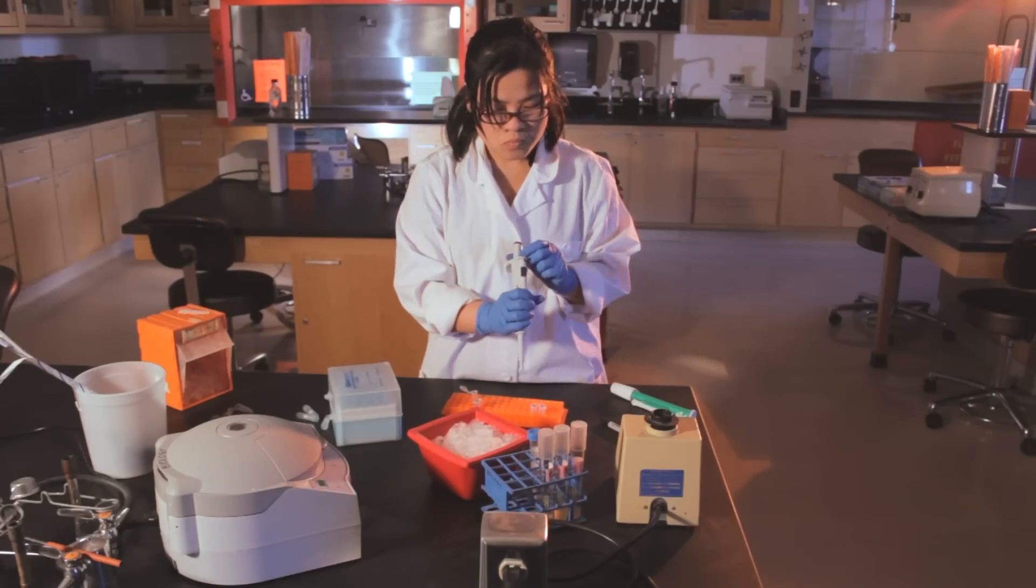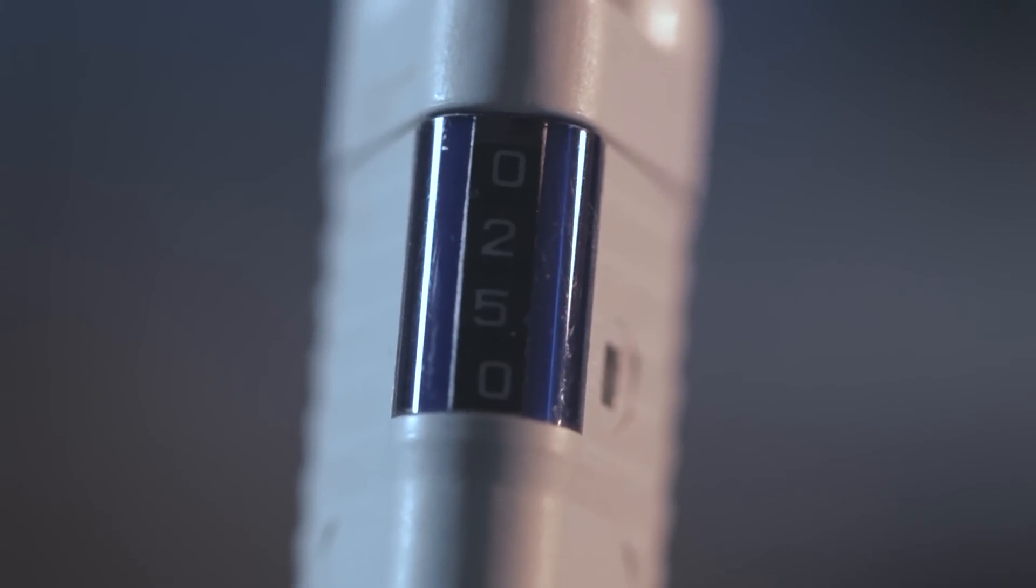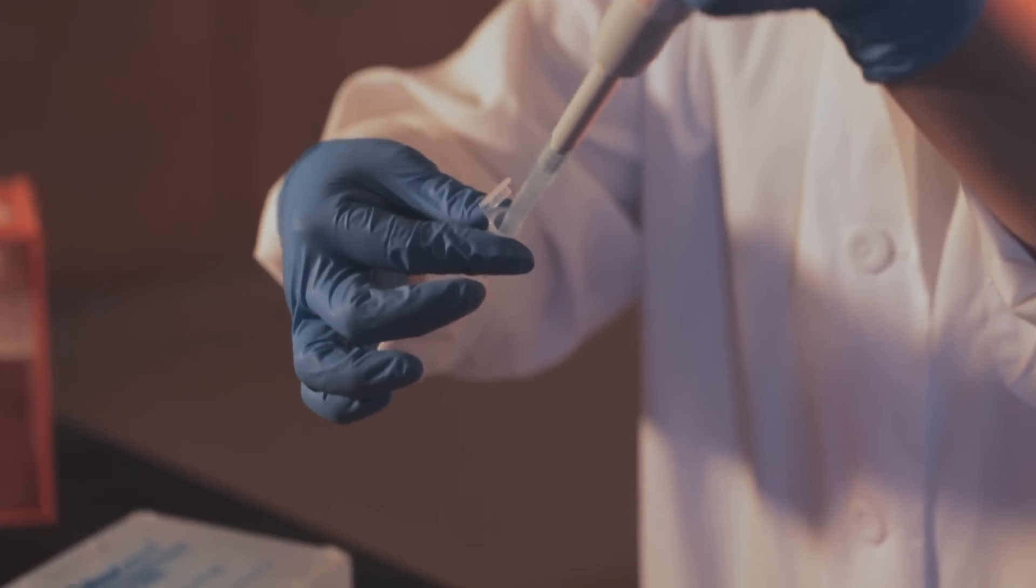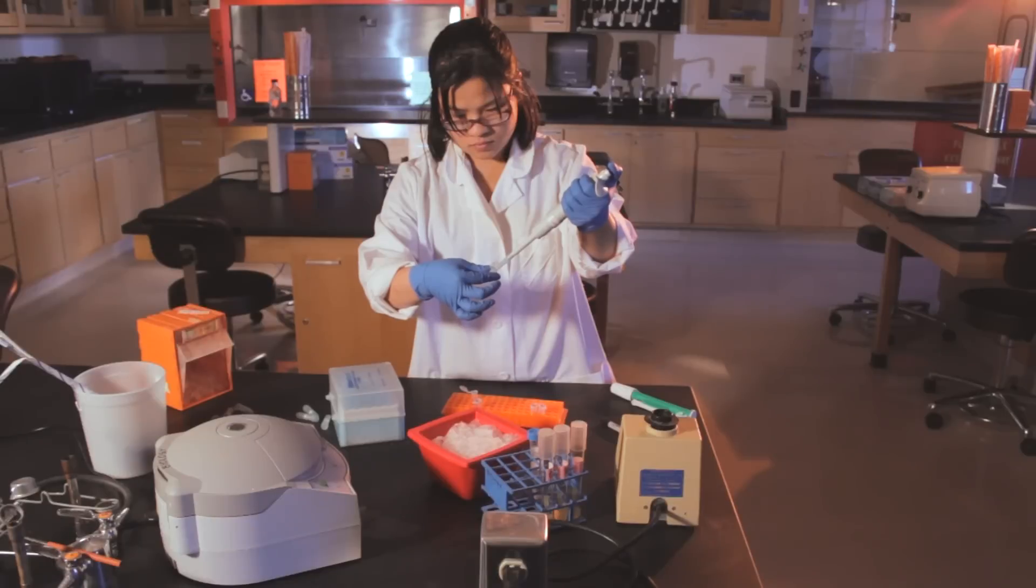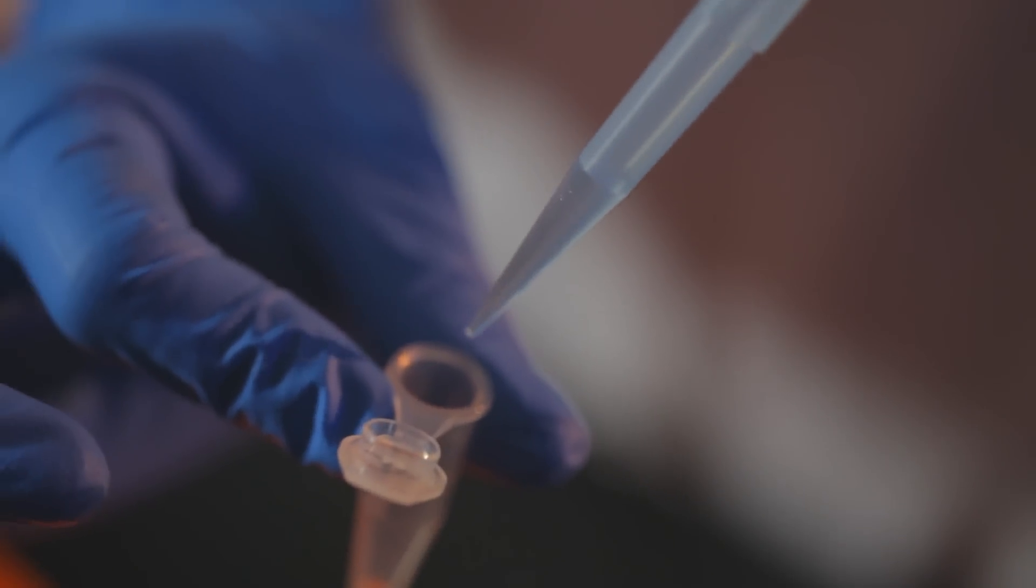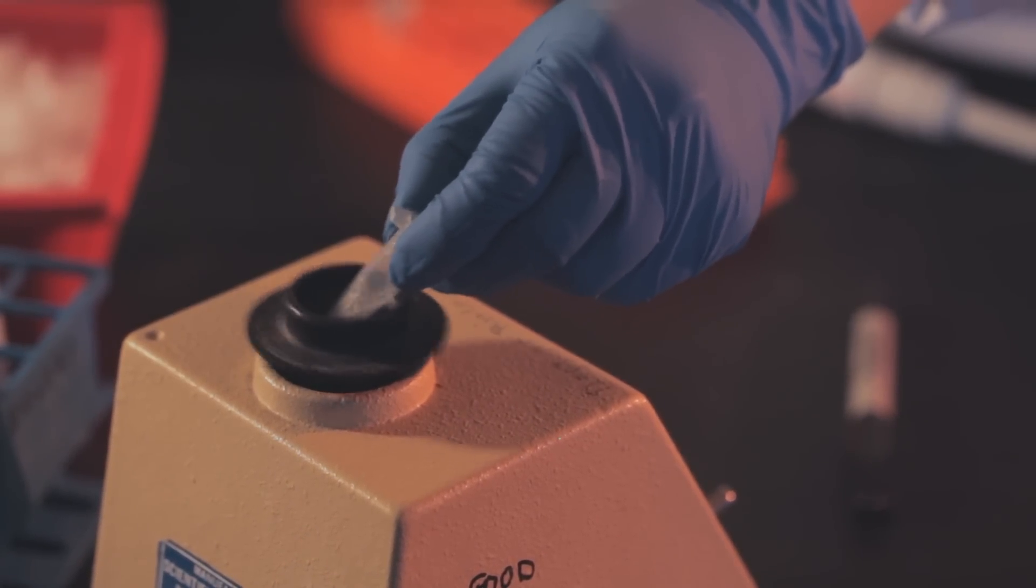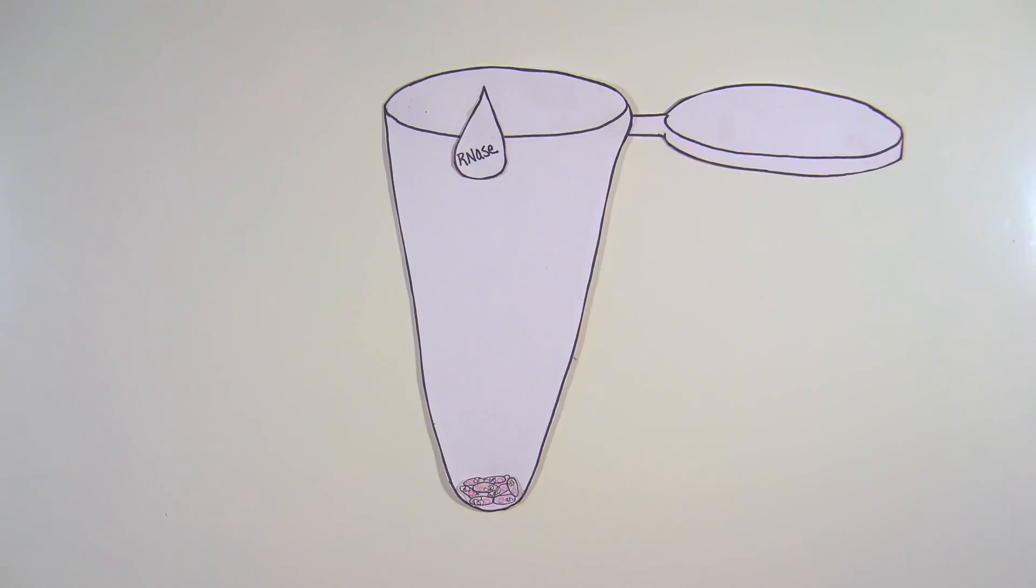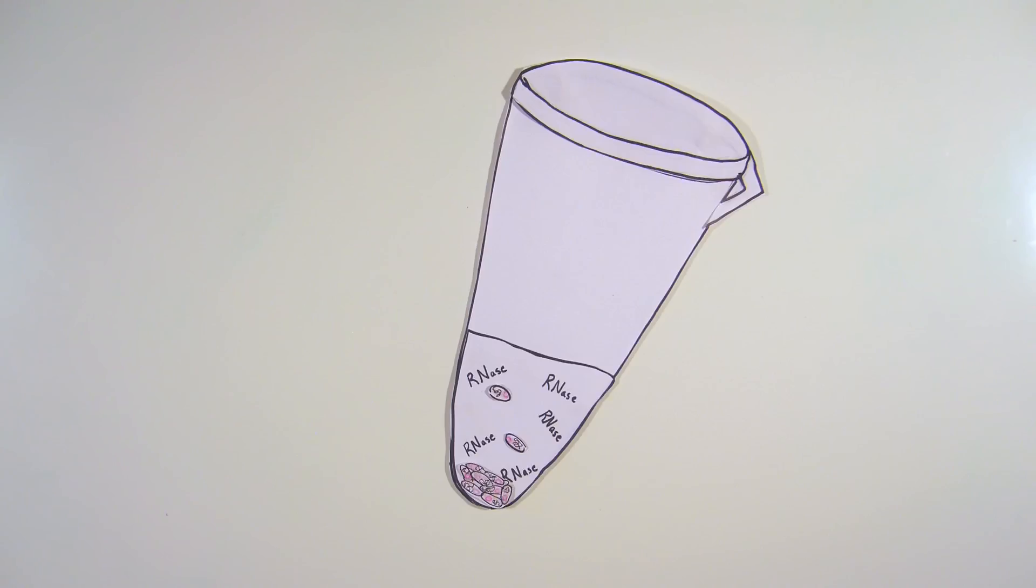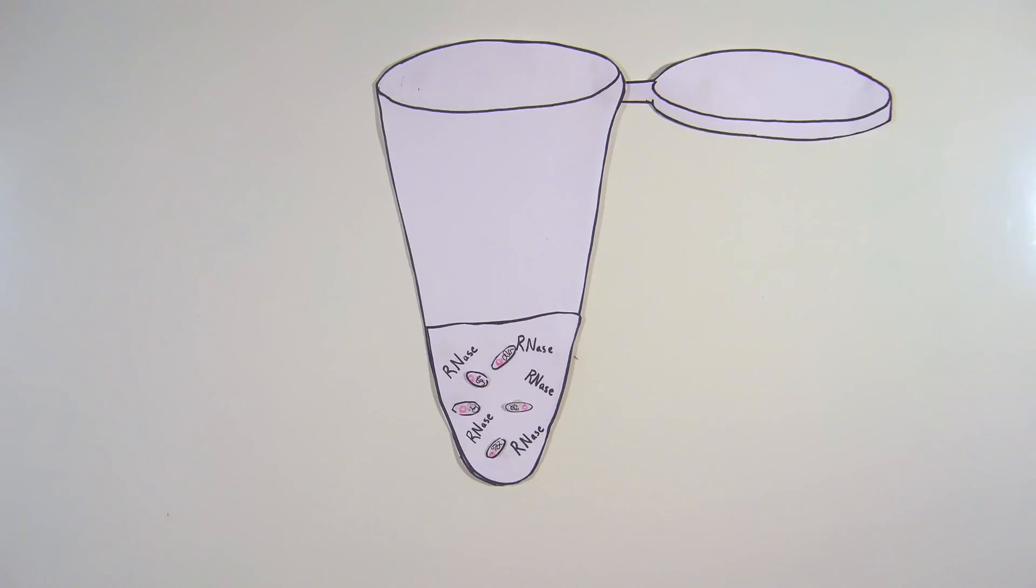Resuspend the pelleted bacterial cells in 250 microliters of the resuspension buffer. Be sure to use proper pipetting technique when you do this. After you have added the 250 microliters of resuspension buffer, mix until no cell clumps are visible in the suspension. The resuspension buffer used in this step contains RNase, which will degrade RNA from the mini prep in the next step when the cells are lysed.